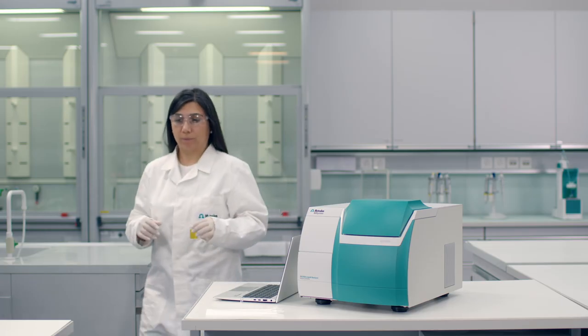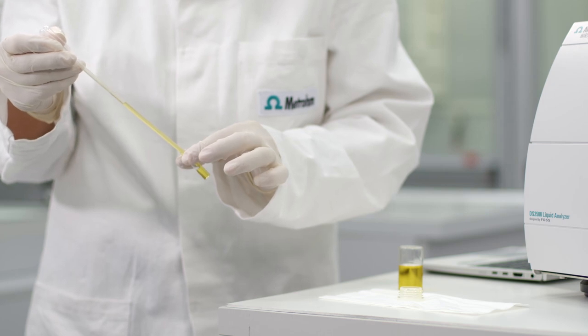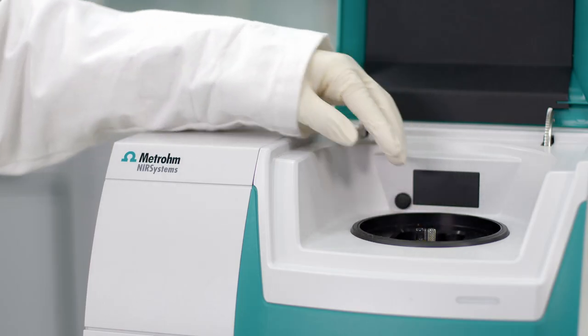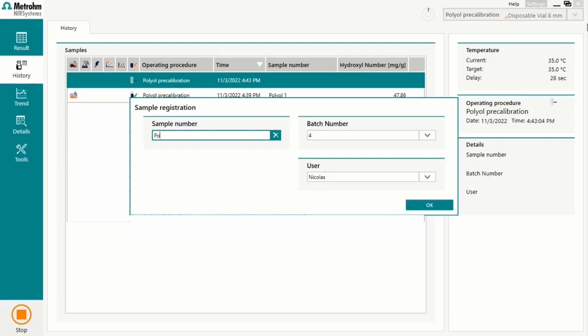It is very easy and can be used by anyone. You only need to fill the disposable vial with your sample, place the vial in the DS2500 liquid analyzer and close the lid. The software will start the measurement directly and only requests that the user enters all necessary information such as sample name or batch number.